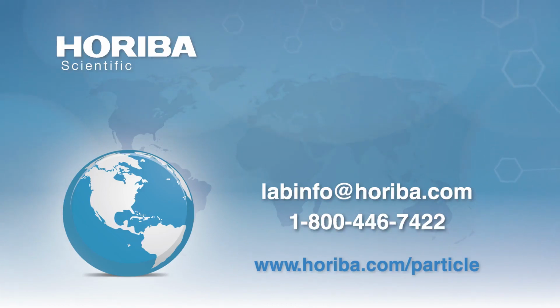So storage depends upon those solution conditions, and if you've made it stable, then it should stay that way. And you can measure the zeta potential, and you can also follow it with particle size, because if there's aggregation taking place, then the particles will get bigger, and there are plenty of papers in the literature showing those studies.